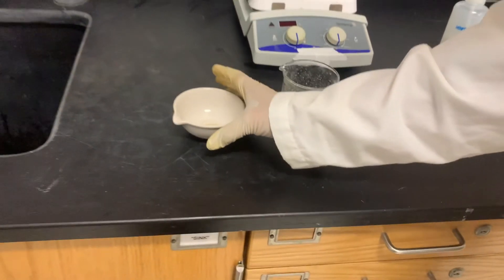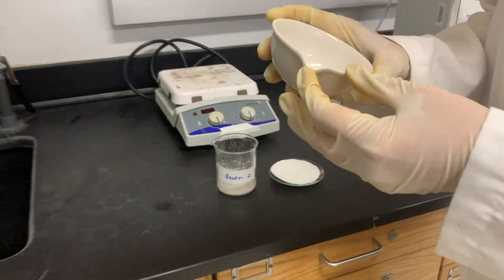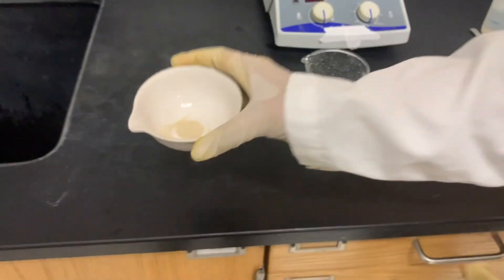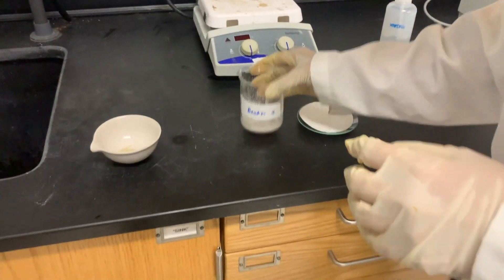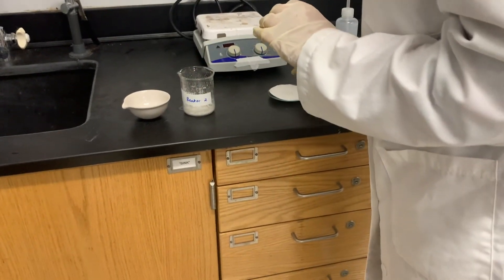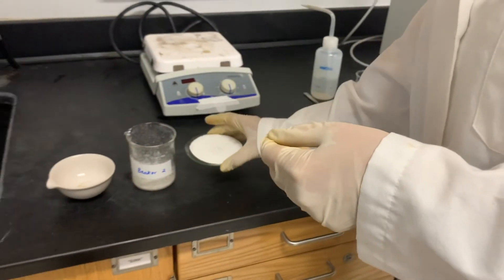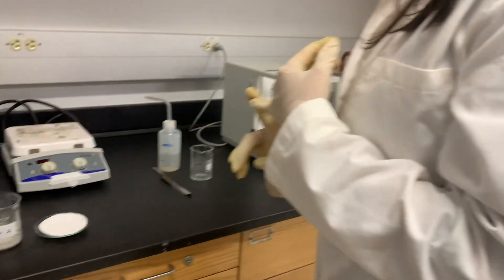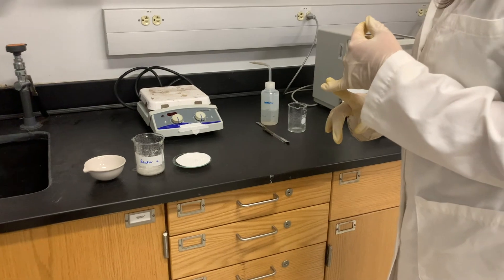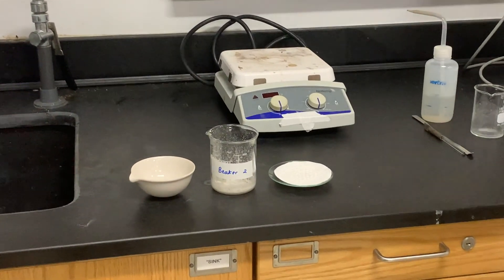For the disposal of chemicals: the oxide is essentially sand and can go into the regular trash can. The chloride can be washed down the sink. The carbonate can also go into the regular trash can. We should clean up everything, turn off the hot plate, and put all glassware back into their original places. Thank you.